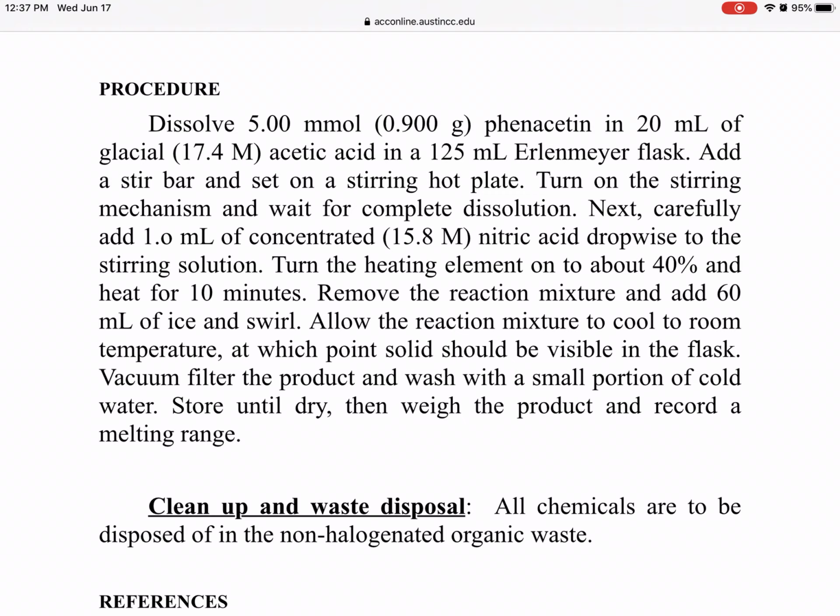To make it a little more soluble, because it is an organic compound, you can add a few drops of ethanol. Ethanol increases the solubility of organic compounds, but not too much, otherwise it will not reform when you cool it down.